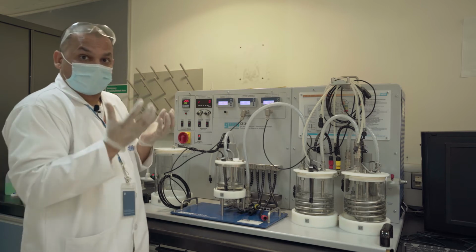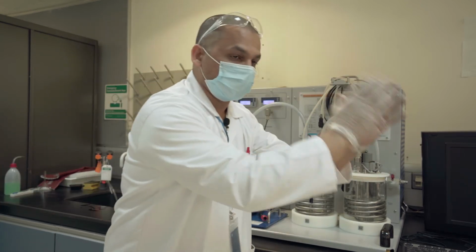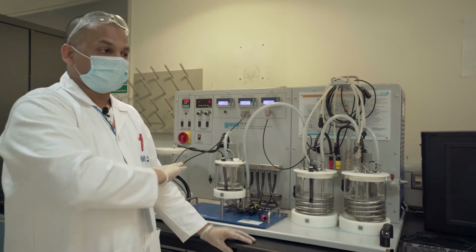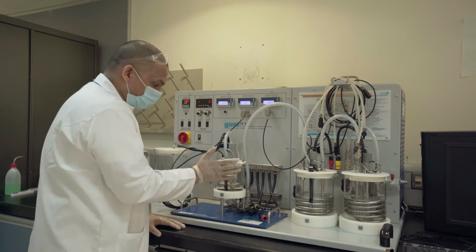The entire experiment I can do in the batch reactor, or I can do it in the CSTR, or in the LFR or PFR. It's just whichever is easier for us, we follow that way. So I can do the entire experiment here.